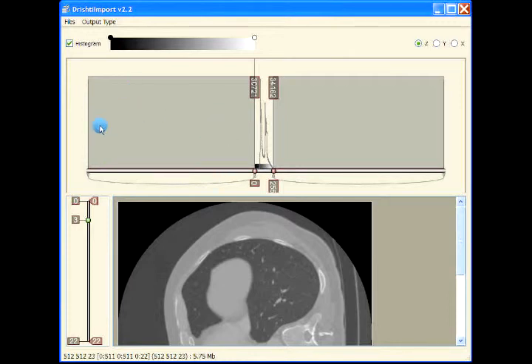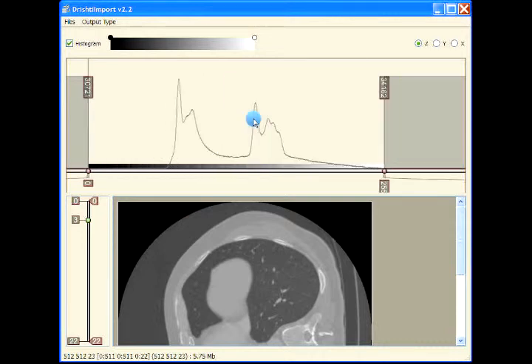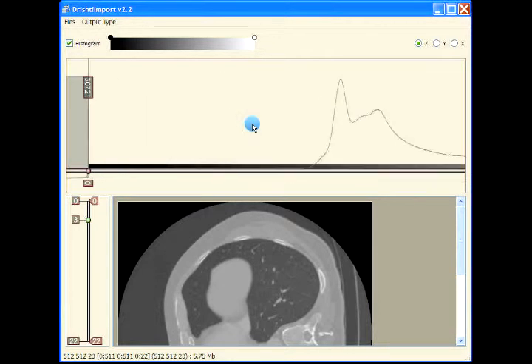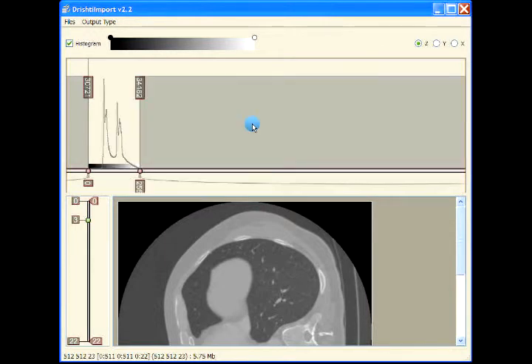So you might start with an empty screen because it might be showing just this portion of the histogram. When you press H, it will always place the minimum and maximum within the window. So press H to get minimum and maximum within the available window, and then, if you have a mouse wheel, you can use the middle mouse wheel to change the horizontal size of the histogram, or you can use the left key and right key. So right now I am using the left key and right key on the keyboard.